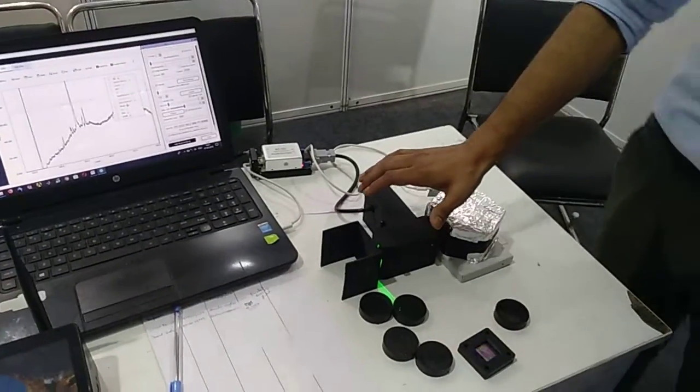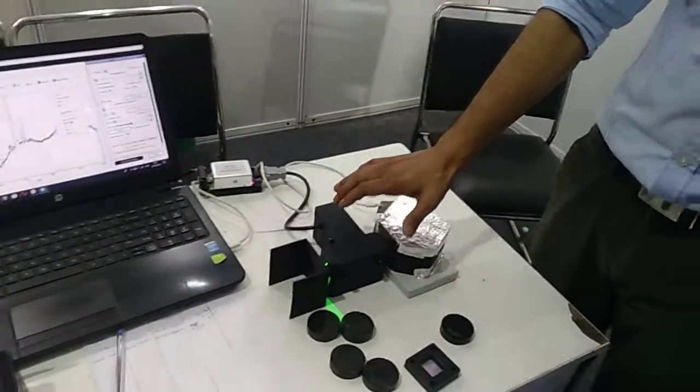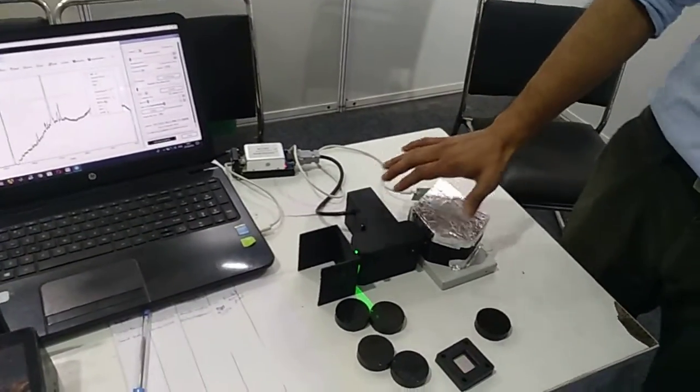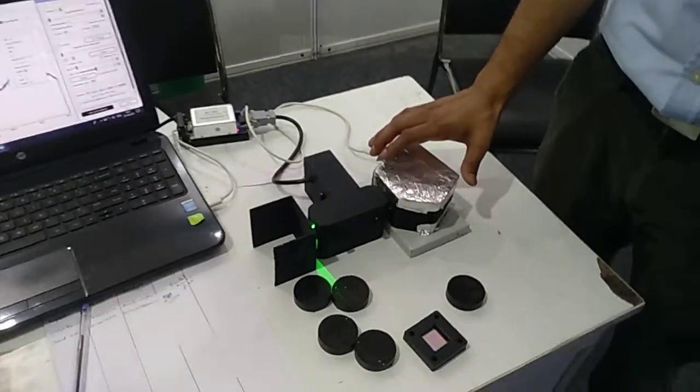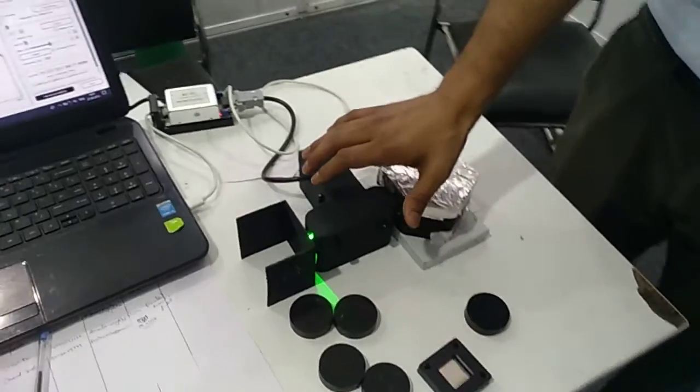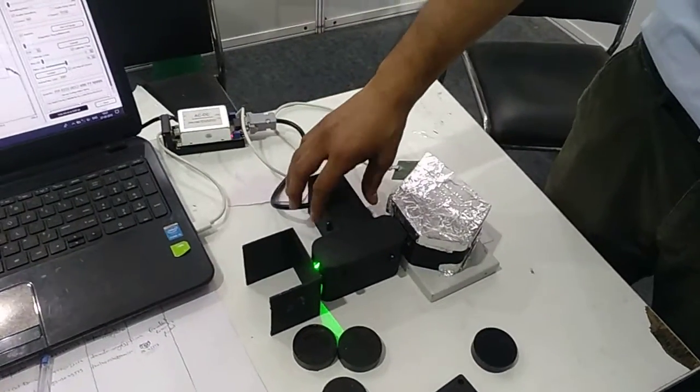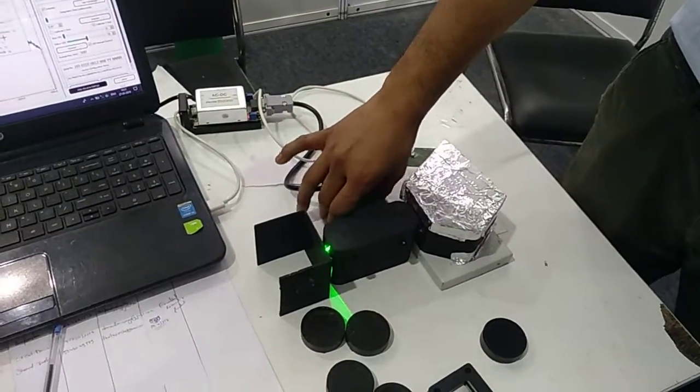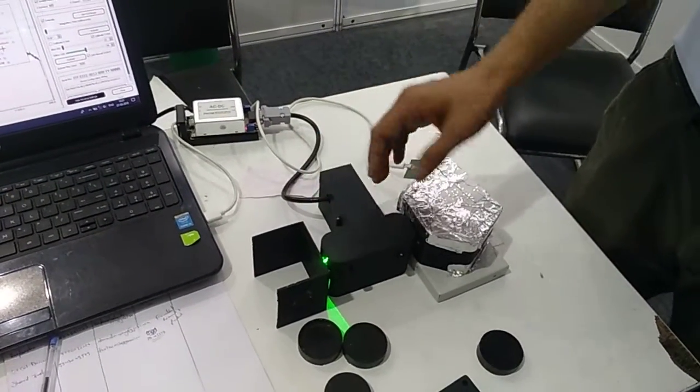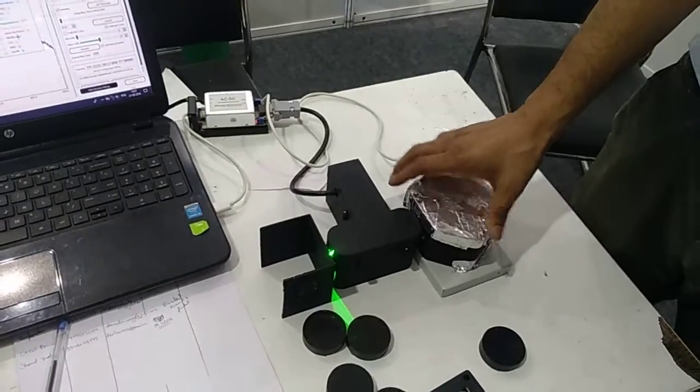The latest product is a Raman spectrometer, named after Dr. C.V. Raman, who developed the technique in 1930.